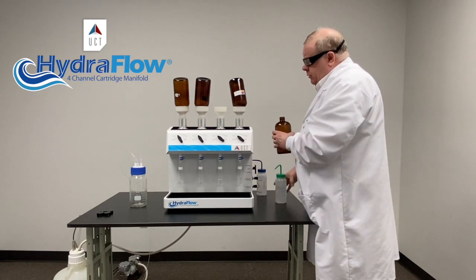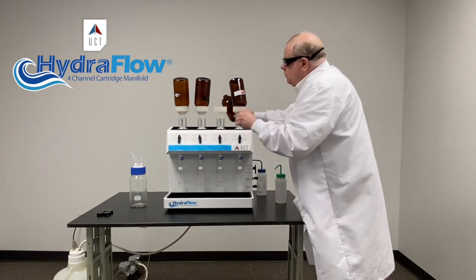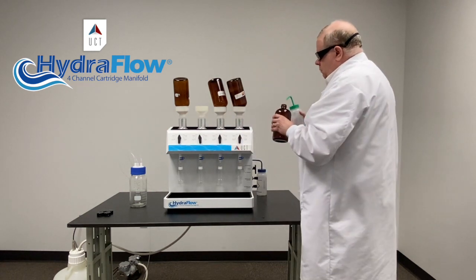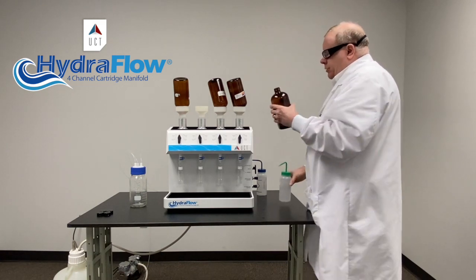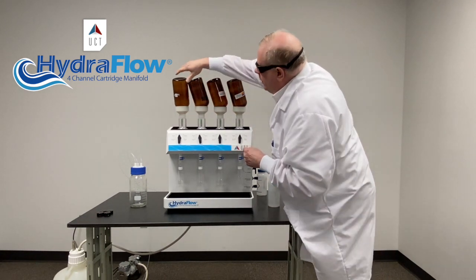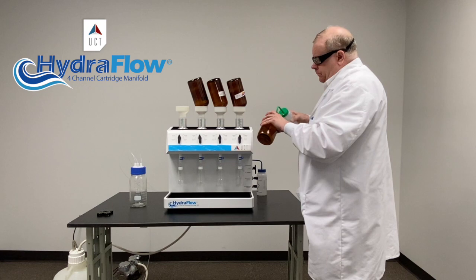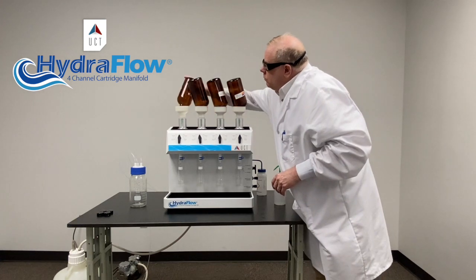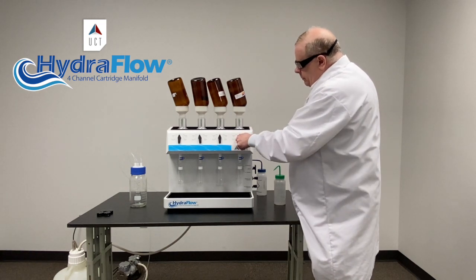If you want, you can actually turn these off if you're concerned about recoveries, and again let it soak for a while. The C18 we use in our oil and grease cartridges is very powerful, and so soaking is really necessary. Not so much with our other C18s or our DVB cartridges. We'll let it soak, then we're going to open it up and pull — not too fast.